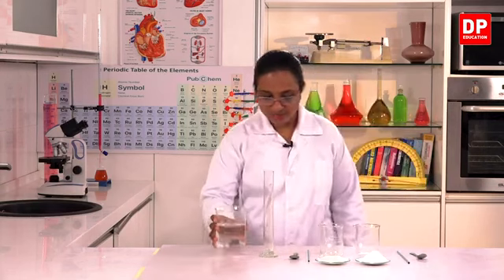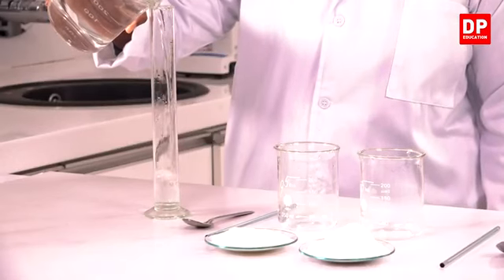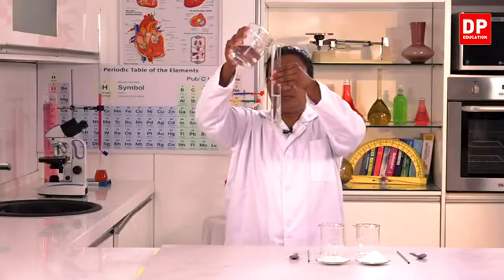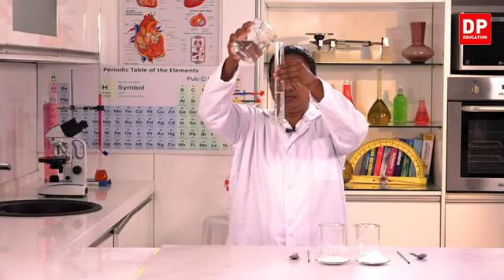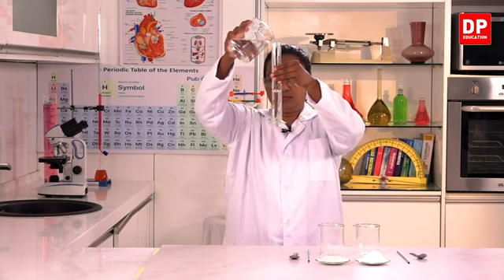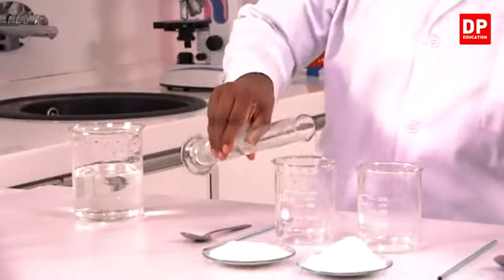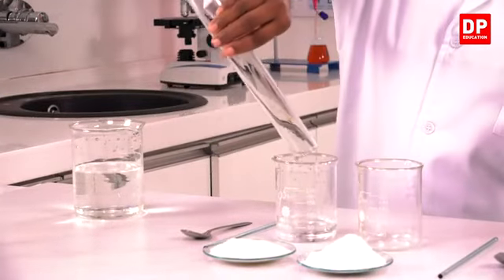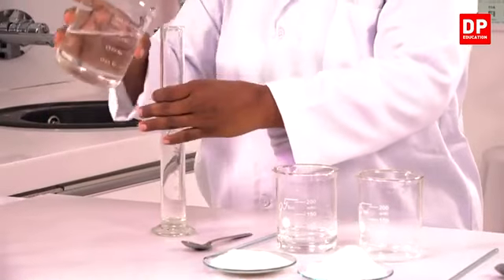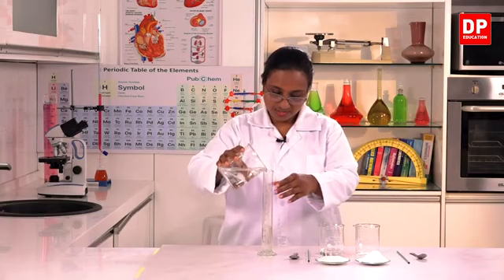So first I will take 50 centimeter cubes of water to both the beakers. So I have 50 centimeter cube of water in one beaker and to the other one as well.